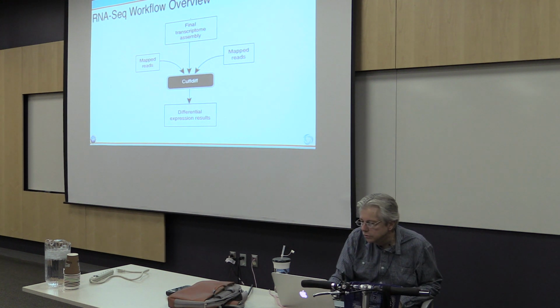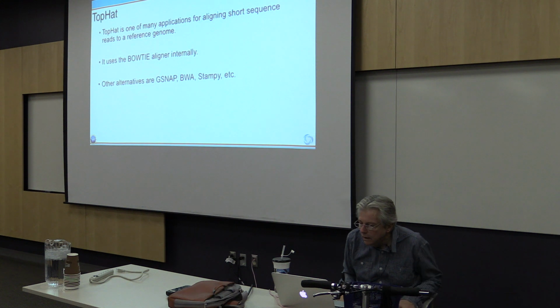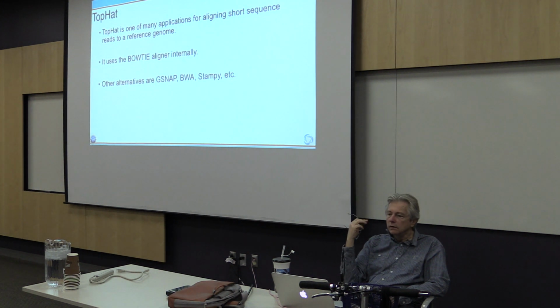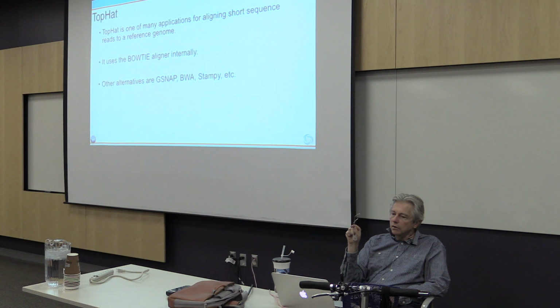And again, your ultimate result from this workflow is the differential expression information. So here, now TopHat is one of the many applications that are available, but TopHat was designed as part of this whole workflow, and it's a pretty efficient, these days, mapper. But as I've brought up before, it's not just that it maps reads to the genome. It also will do it in a smart way.